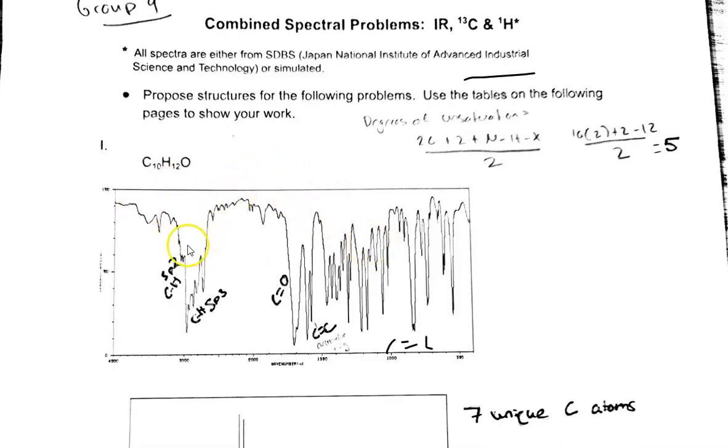First, looking here at the IR spectrum, what stands out to me is this C double bond to an O, the clear signal here around the 1700 range. You can see the sp3 C-H bonds that I have, because it's less than 3000, and then over 3000 there's an area here which is the sp2 carbon-hydrogen, indicating the double bonds in the benzene ring.